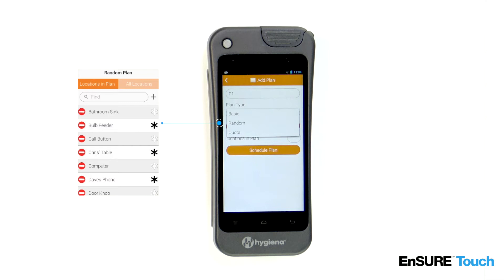To mark a location as required from the plan location screen, touch the star icon to the right of the location's name. It will turn black when selected.